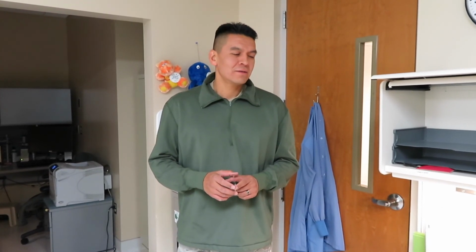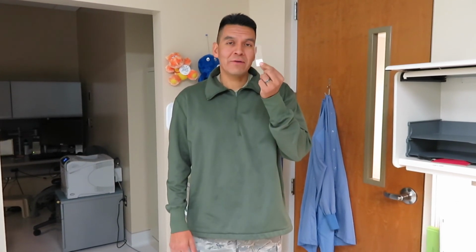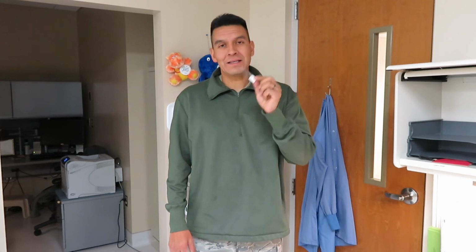Hello everyone. So I just wanted to give a little spill of what we do in the pathology world, the histology pathology world, and what the histotechs do as well, from when the surgeons or doctors get a biopsy and they send it to us, and how we make it into a slide like this. How I look at this under the microscope to make a diagnosis of cancer or not cancer.